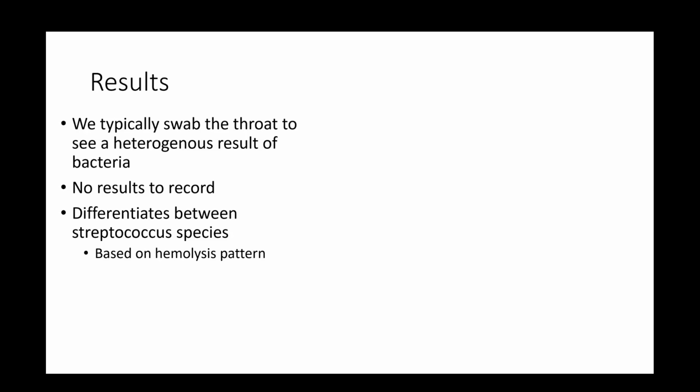In lab, I can't show you any results today, because we don't want to work with these bacteria. Bacteria that have these hemolysins, at least alpha and beta, are known human pathogens, and we would rather not work with these in lab, simply because the threat of contamination and an active infection is too high, and there's no reason to put students at risk for this.